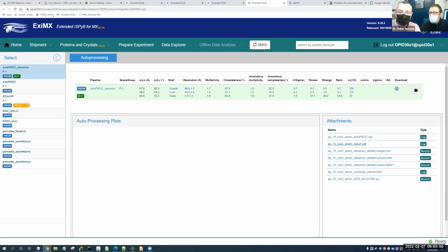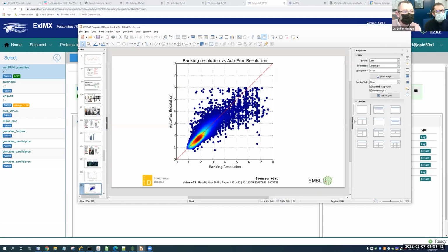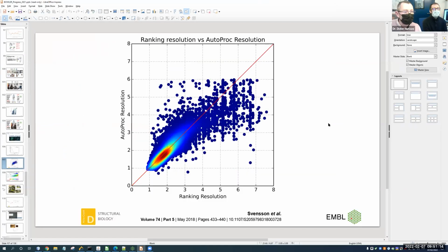Are there any more questions? If not, then we'll just say again what we are doing at the moment, which is more development, but shortly will become available to all of you: the dehydration and the harvester and all this kind of stuff. Matt will present that, and that's basically just a more practical view of what Serena showed already, and that's why we are working mainly on that.